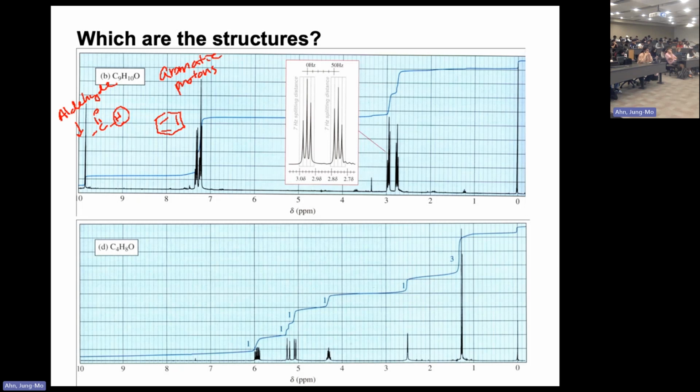I don't know, about half step. So 1, 2, close to 3. I don't know, right? 1, 2, 3. Something like that. So it has to have a somewhat large number of hydrogens. There's no way it could be 6 because it has to be substituted. So I should say there should be many hydrogens, not just 1 or 2.